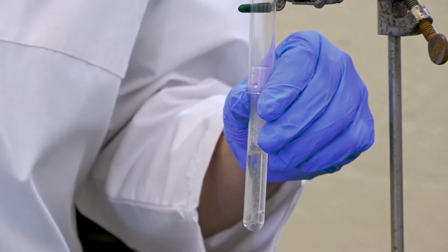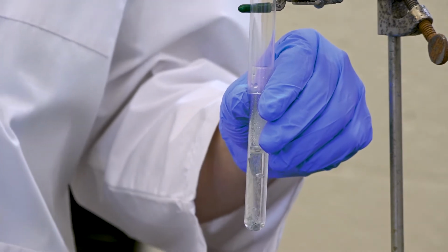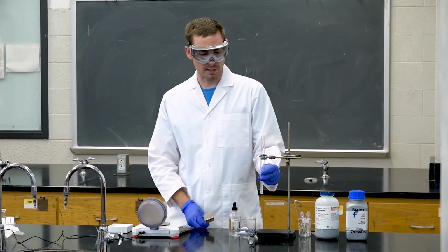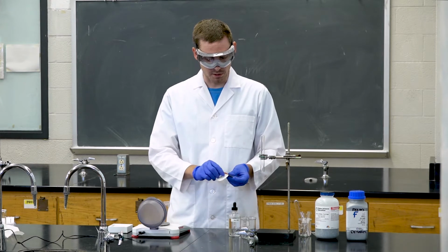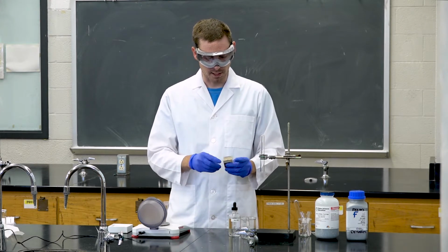Hydrogen gas is flammable when combined with oxygen and a match, and we will perform that here next. So after about a minute or so of allowing the gas to be collected in this upper test tube, you can then have a partner light the match for you and see what happens.